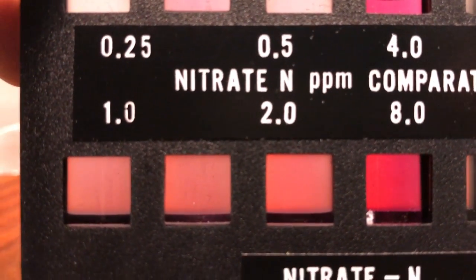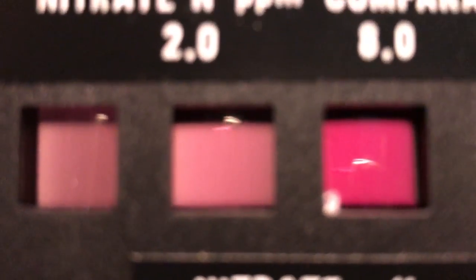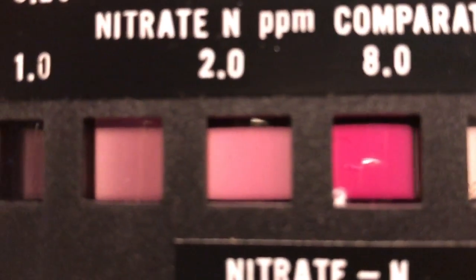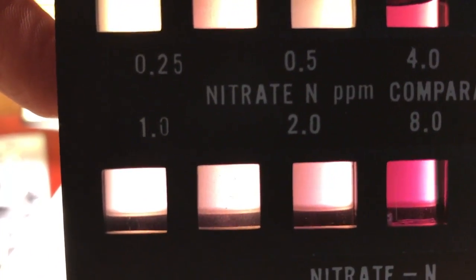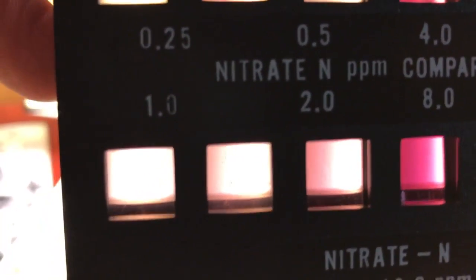Don't be fooled when using test kits like API — they're not going to be anywhere near a Lamotte. These Lamotte test kits are extremely expensive: 40 to 60 dollars per kit, and the reagent refill for nitrate alone is about 35 dollars. This is not for children — this is not an ordinary test kit. When someone brings these out they mean business. If you claim zero nitrates and they pull out a Lamotte, they're going to know if you're telling the truth. And dipsticks — those give you a ballpark figure too, not as accurate as a Lamotte.